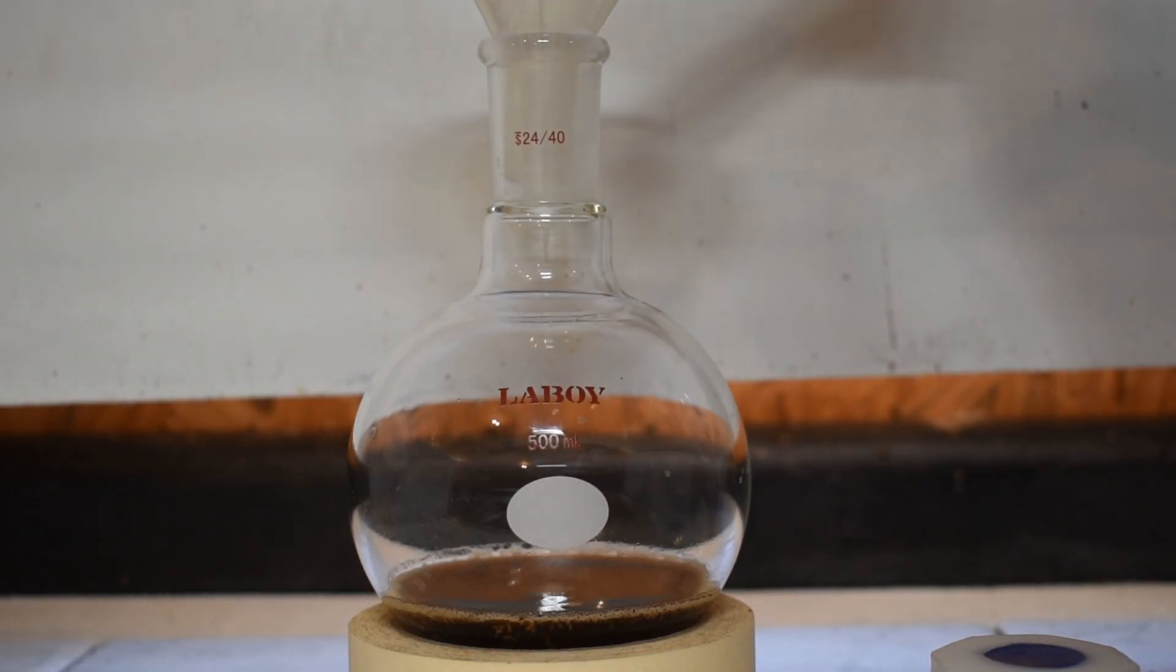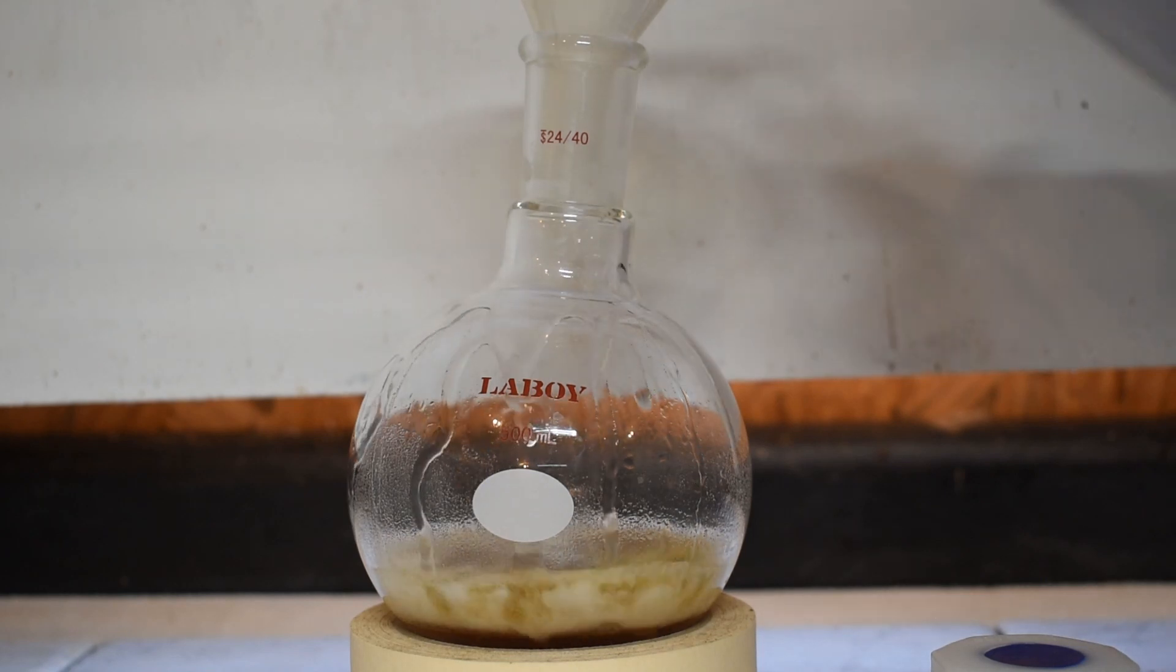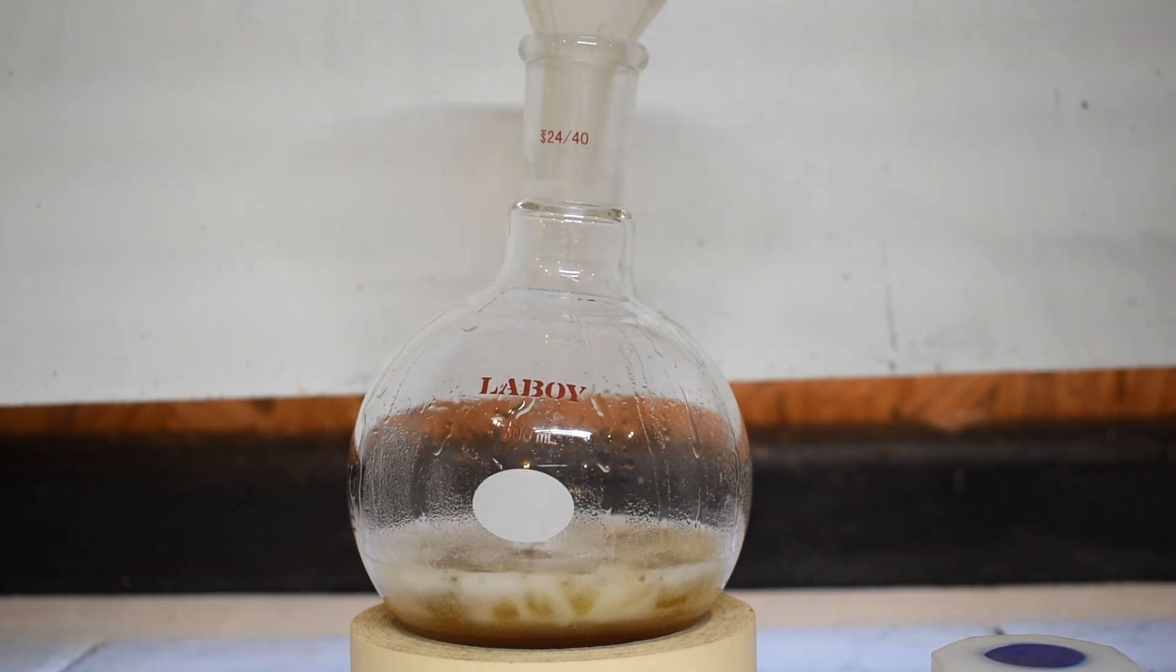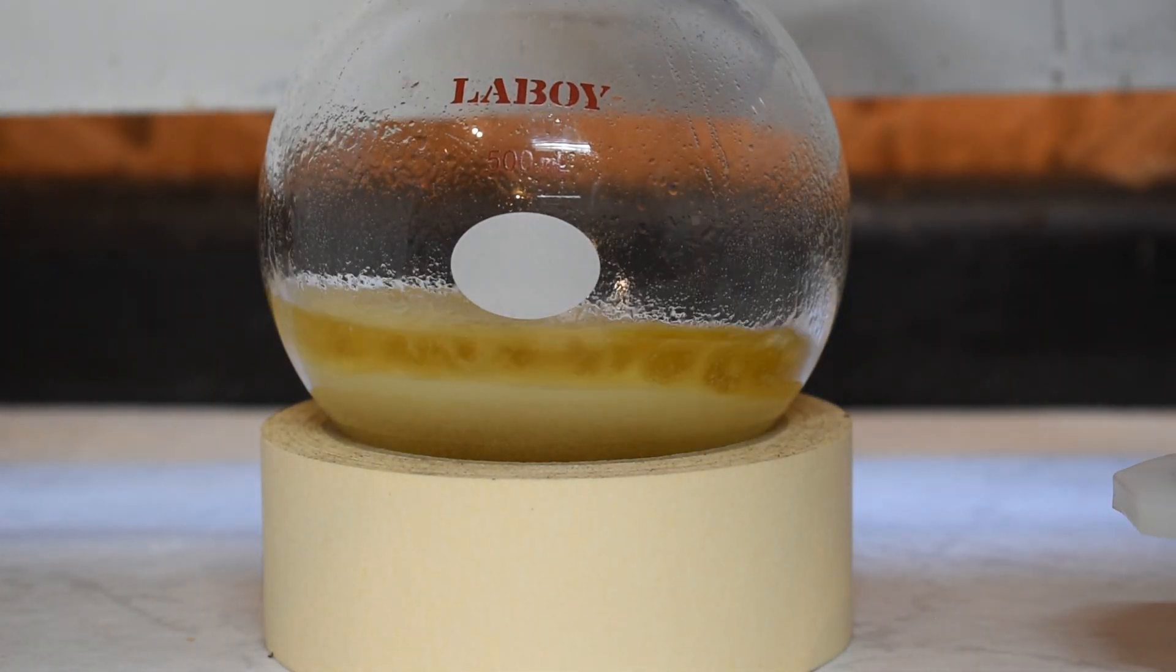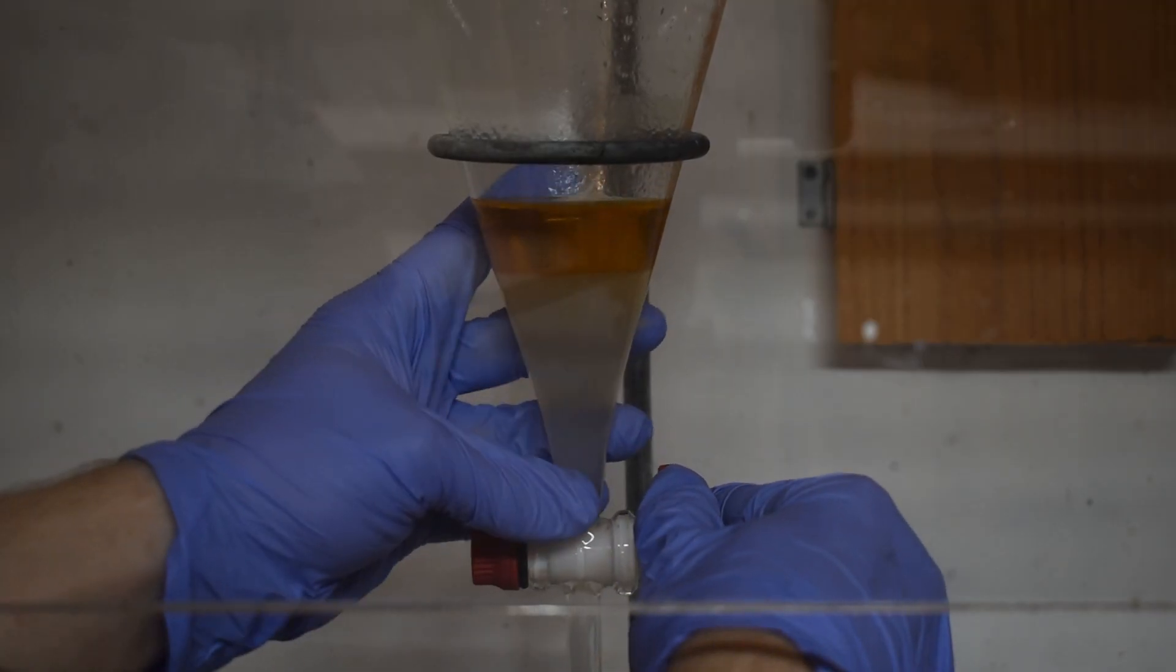After the reflux was complete, I added some baking soda to the mixture to neutralize any leftover acids, and I also added some water as well. The water should help dissolve any leftover acetic acid as well as sulfuric acid, and it will also dissolve any chunks of sodium bicarbonate left over from the reaction. I then transferred this mixture to a separatory funnel and filtered off the bottom layer.